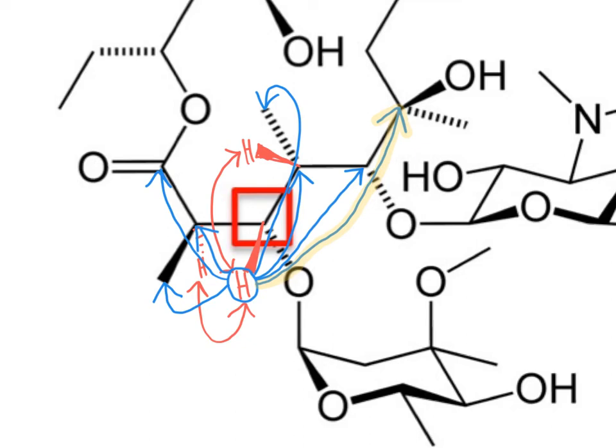And that's why HMBC spectra can become quite complicated once we start to think about the multitude of 2 to 4 bond correlations. But that multitude of signals can be very helpful in piecing together the structures of organic molecules when you combine that information with things like the COSY correlations that we see here shown in red, representing which protons are separated as being vicinal to one another.